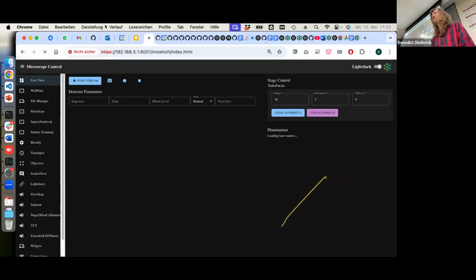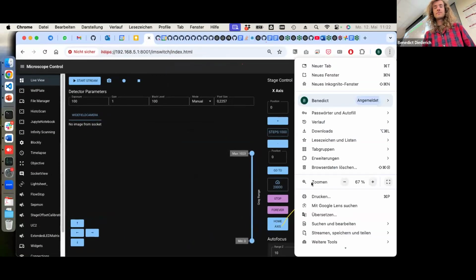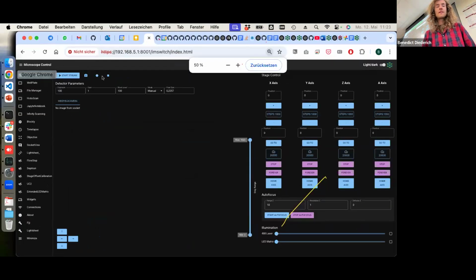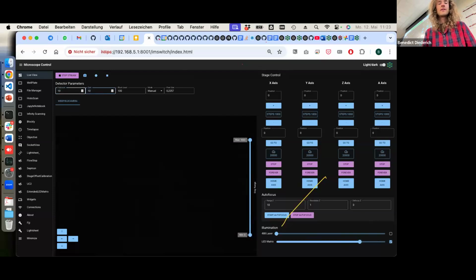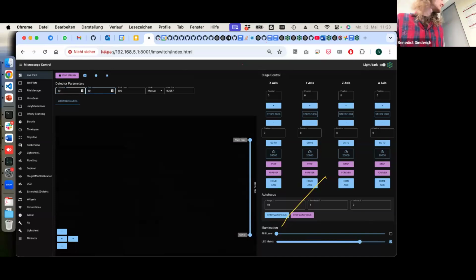So let's see whether we can see that. Yeah, it's alive. Cool. So this thing here, let's see, what is the full screen mode? It's not here. It doesn't matter. I mean, you see it anyway. Let's see whether the camera works. Yeah, looks good. It's dark. You can also come over and we can try to have a look. Okay.